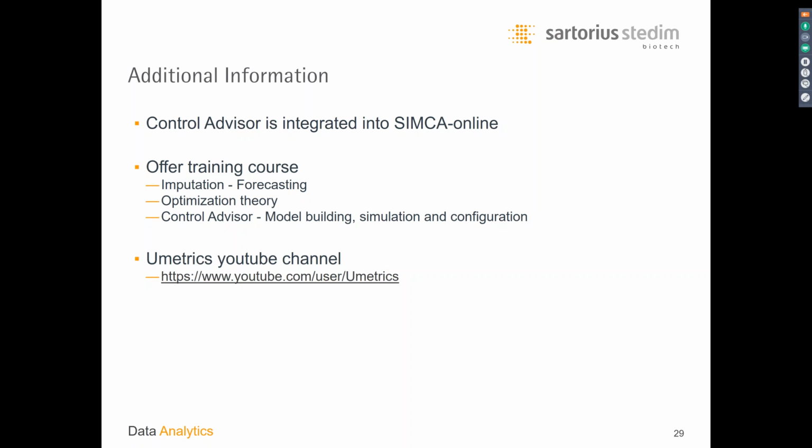So these methods and Control Advisor are a module that runs inside of SIMCA-online. It's an extra module, let's say, but it's included as part of SIMCA-online if you have the license for it. If a half-hour quick seminar like this isn't quite enough, which I expect it's not, we offer courses, or if you're going to entertain Control Advisor, there's much consulting that's offered as part of that as well. But we do train in the methods for education purposes as well.